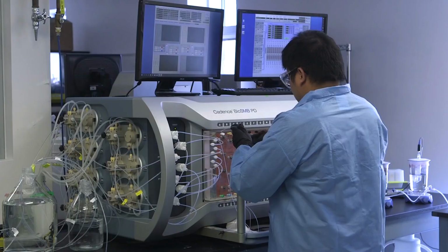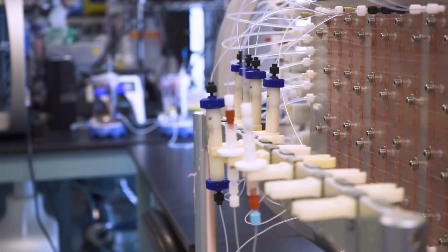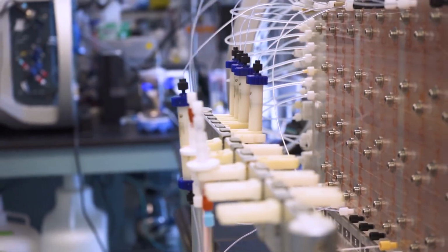So having got the building blocks, all we now do is take exactly the same processes that you would have done in batch. In other words, the same cell culture media, the same chromatographic media, the same membranes, the same buffers, but we just do them in a slightly different way. Therefore, the challenge from going from batch to continuous shouldn't be very difficult.